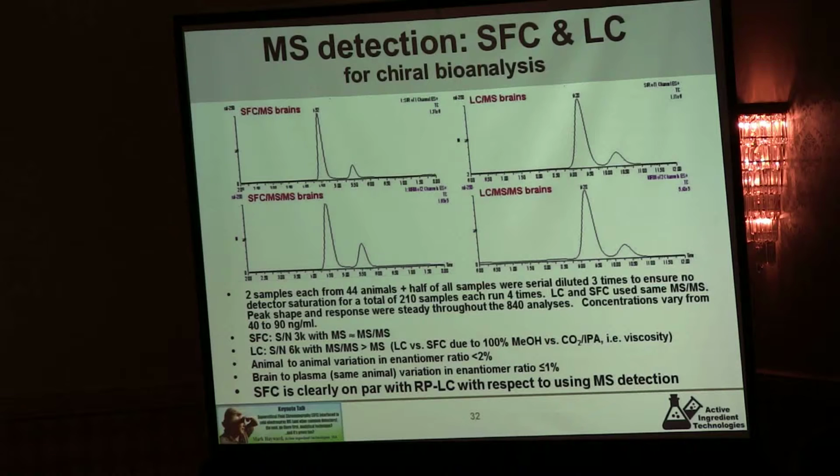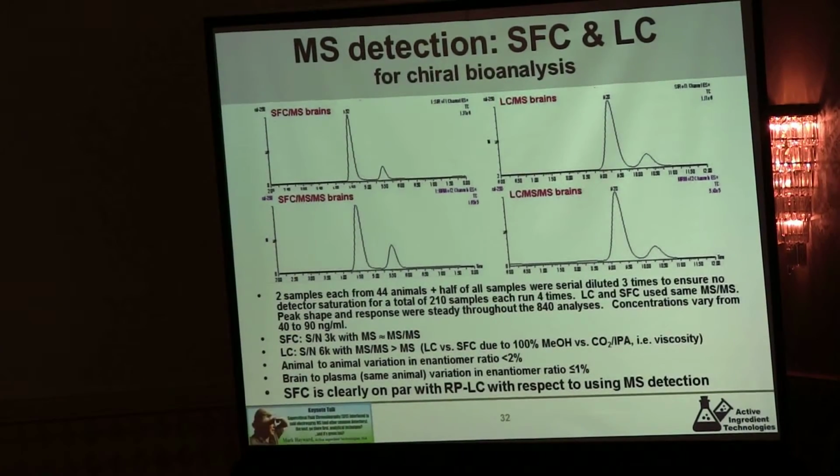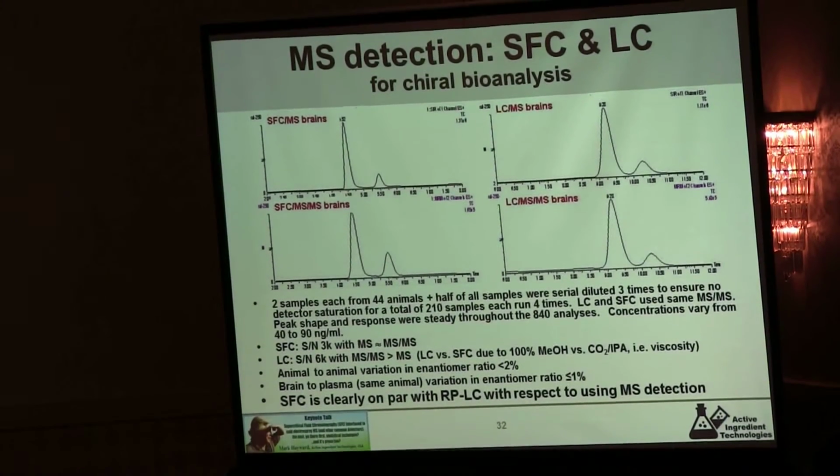So to do the LC-MS, we had to use methanol, and to do the SFC-MS, we had to use IPA, and that accounts for that last factor of 2 in sensitivity. But the heated interface brought us orders of magnitude there, so it got us really right to where we would expect to be. We essentially normalized the response between the two separation approaches.